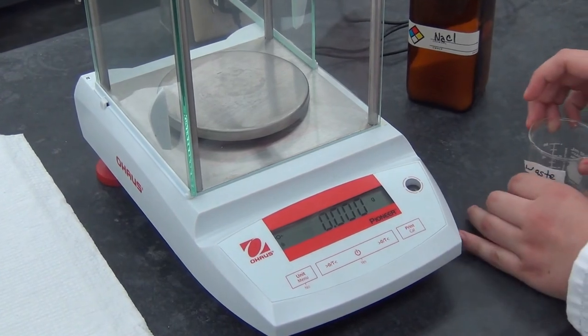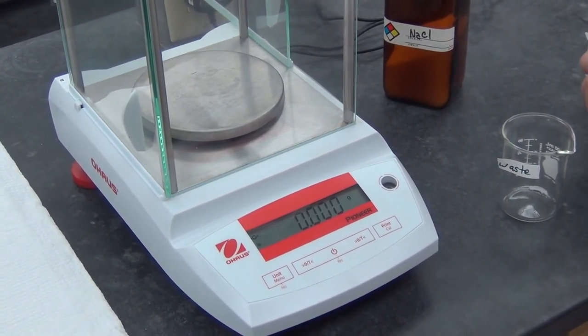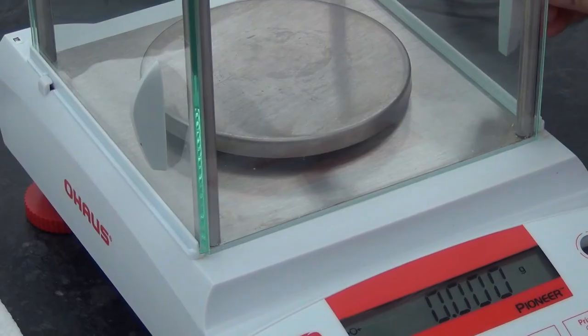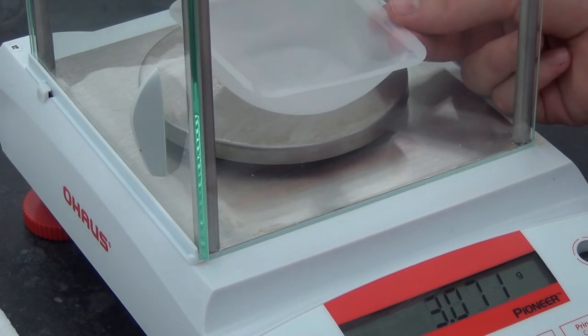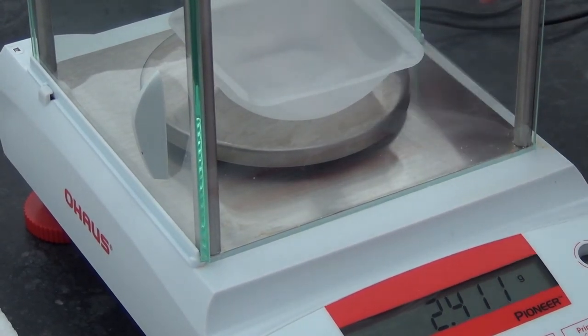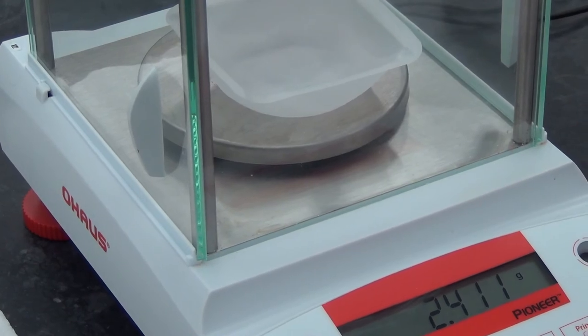Keep the balances clean. Do not weigh chemicals directly on the balance pan. Use a weigh boat, beaker, or weighing paper. Immediately clean up any chemicals which are spilled on the balance. Do not leave stray pieces of paper or glassware around the balances.